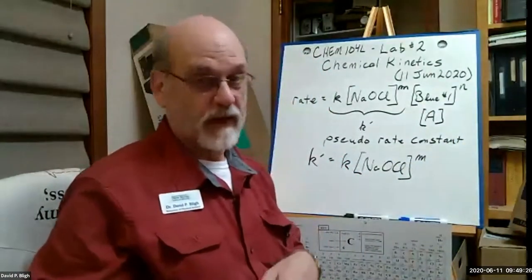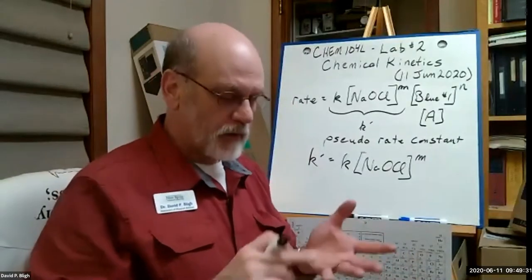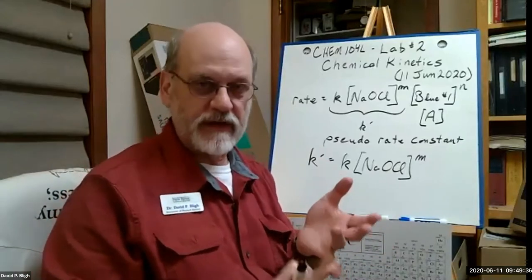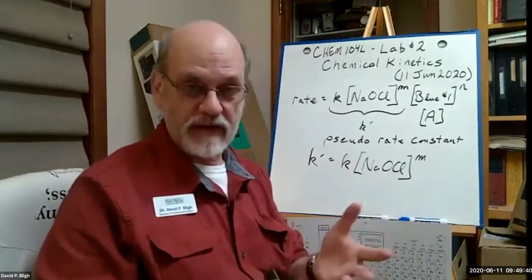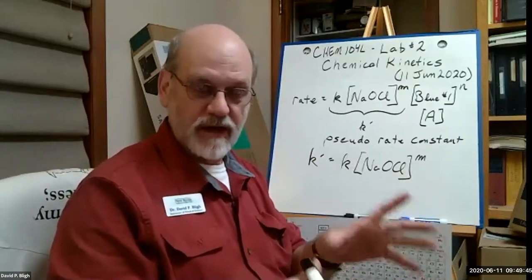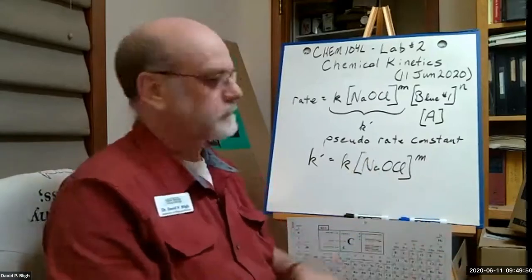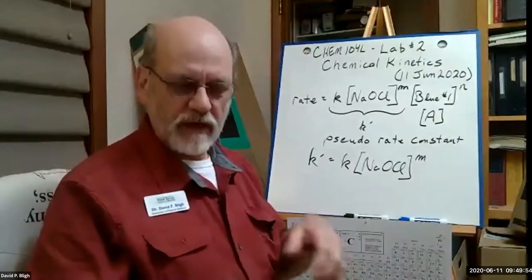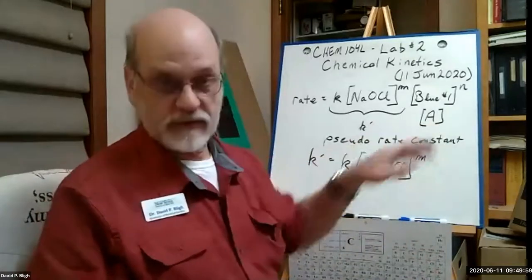Okay? Now, what do I mean by absorbance? All right. I've got a couple of videos that I'm going to show you. One of them describes the use of the spectrophotometer. That is the instrument that we would be using in the lab. And fortunately, I found a video where the description is of the exact model of spectrophotometer that we would be using in the lab if we were there. And then a video to follow that with the theory behind absorbance. What does absorbance mean?